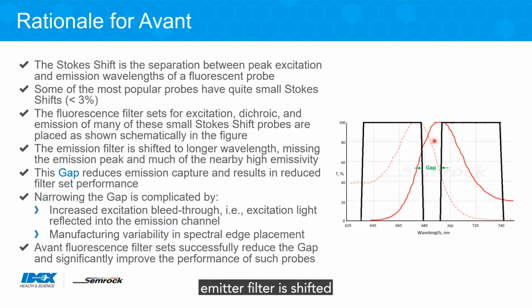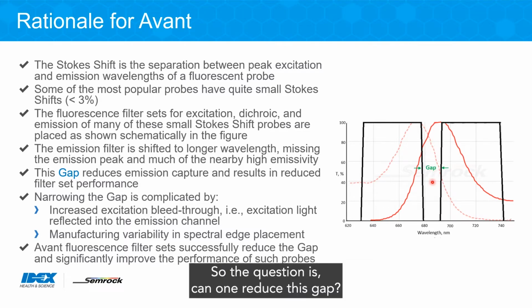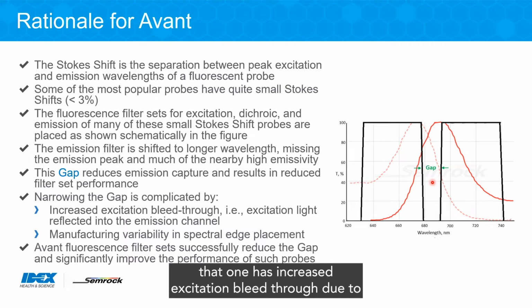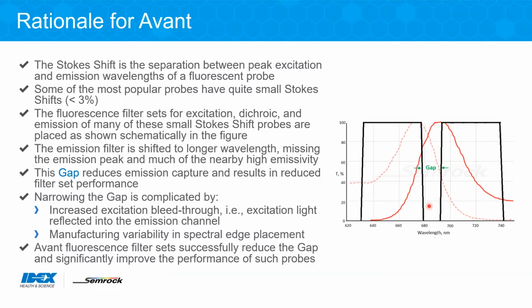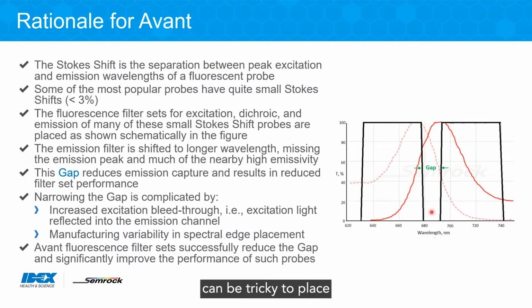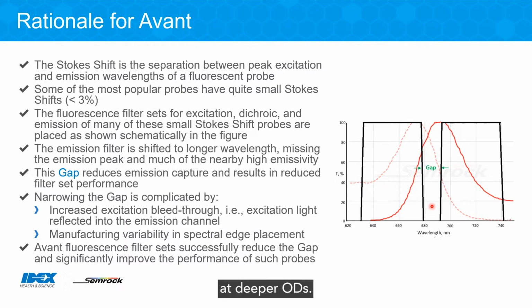That means that the emitter filter is shifted to longer wavelengths. This reduces the amount of light that is captured by the emission filter and reduces the filter set performance as a whole. So the question is, can one reduce this gap? The difficulties involved are that one has increased excitation bleed through due to excitation light reflected into the emission channel, and the fact that this narrow range of wavelengths can be tricky to place filter edges very precisely, and there's a possibility of collision between the filters at deeper ODs.